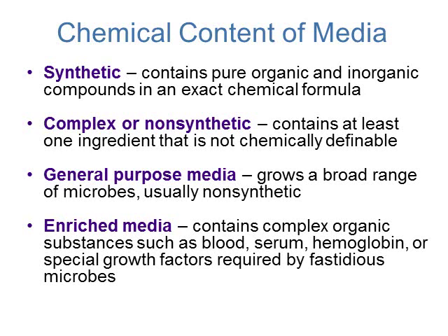We have general purpose media. This is like the nutrient broth or nutrient agar I just looked at. This grows a broad range of microbes, and it's usually non-synthetic, and it grows pretty much anything.